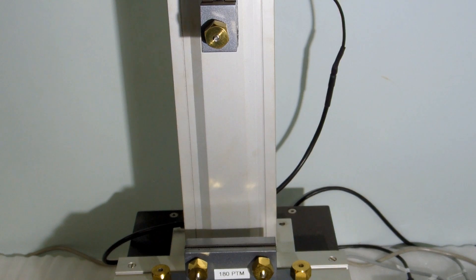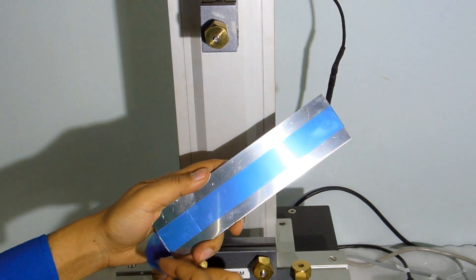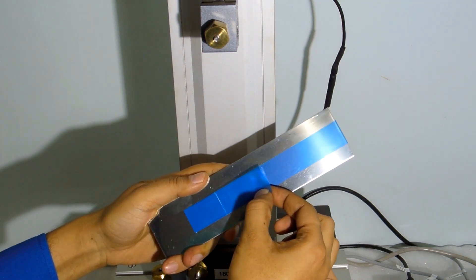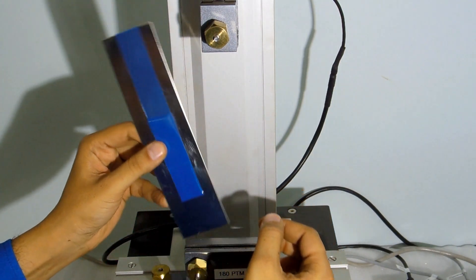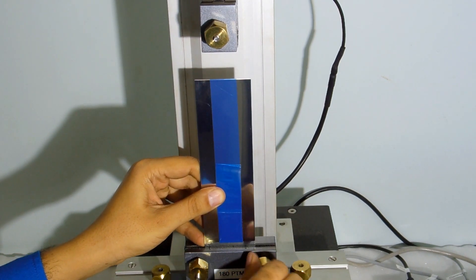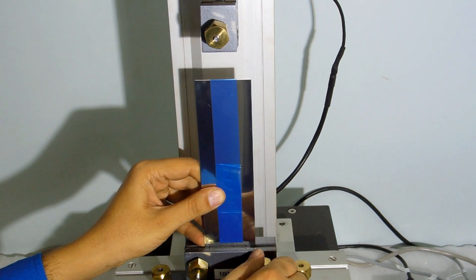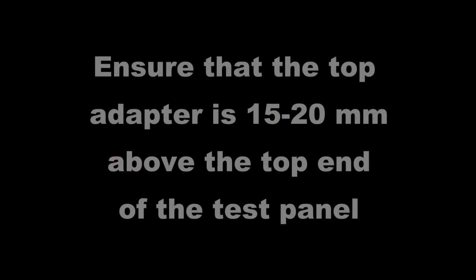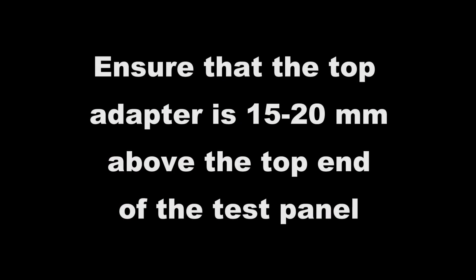Fix the test panel along with the test sample into the lower adapter. Ensure that the top adapter is 15 to 20 mm above the top end of the test panel.